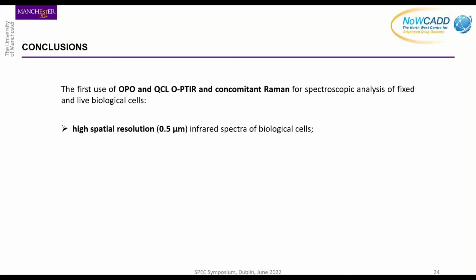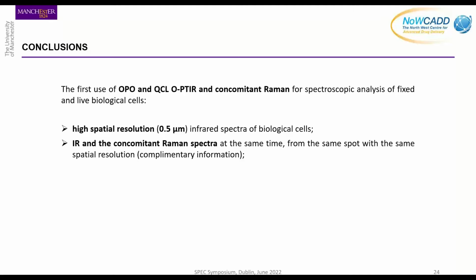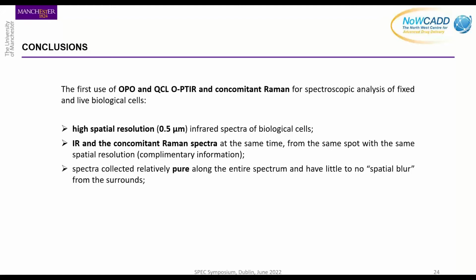We've got high spatial resolution. You can see from those lipid images we were down to about 0.5 micron in biological cells in water, which is the key point. The IR and the Raman were done at exactly the same time on the same spot, which is fantastic. So spectra are collected pure across the entire spectrum, so we haven't got the pixel mixing, we haven't got the problem of changing spatial resolution.